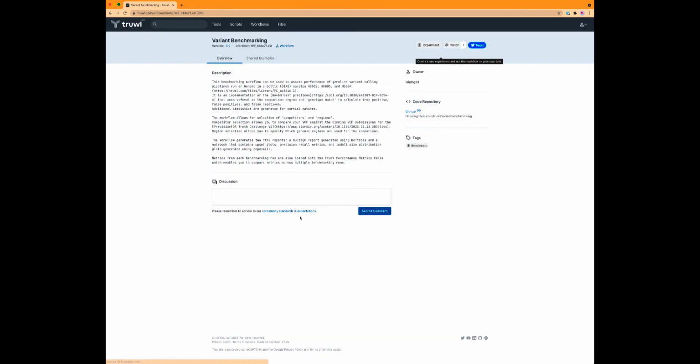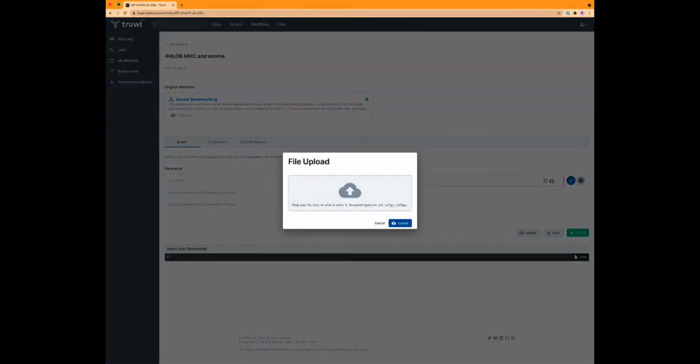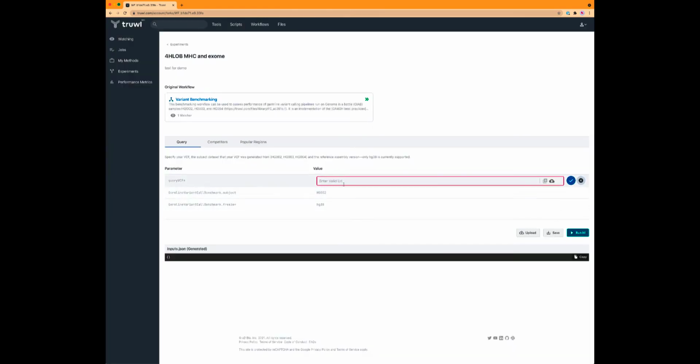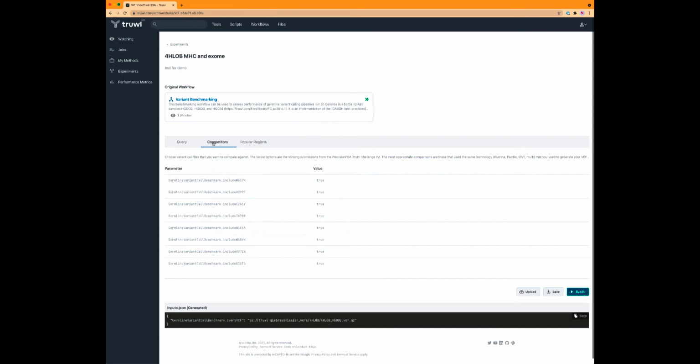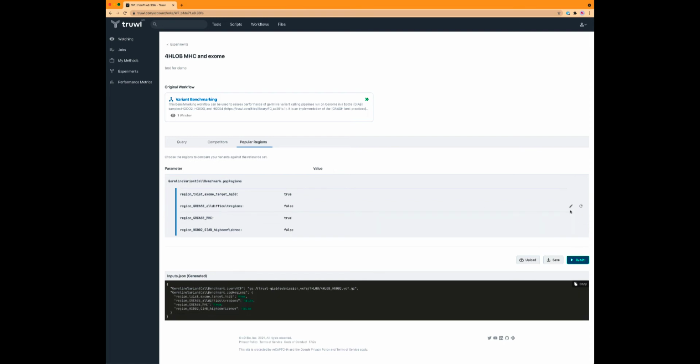Users can either directly upload VCF files, or if they're located in a bucket, simply type in the URI. Benchmarks can be performed on any member of the Ashkenazi trio, and we preloaded 8 category winners from the Truth Challenge to serve as a comparison for individual reports. At this point, users can select a test among 4 popular genomic regions, though we will soon release over 123 other genomic stratifications provided by NIST.